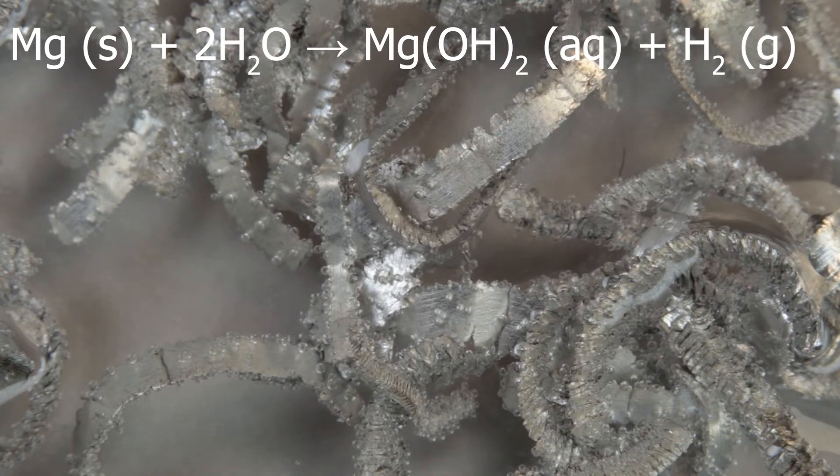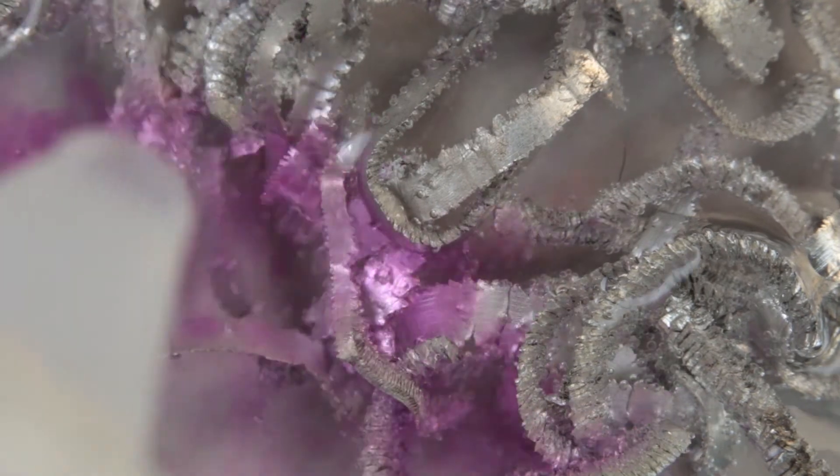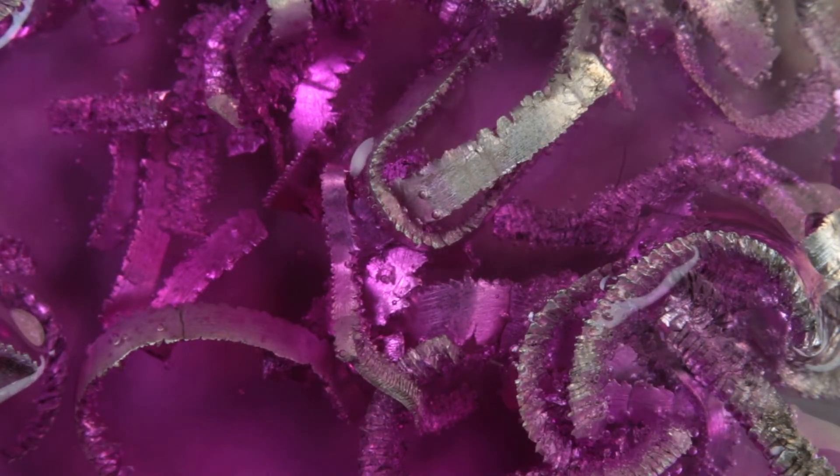Another product is magnesium hydroxide, which is slightly soluble in water, turning solution alkaline. If I take an indicator, phenolphthalein, yes, it turns violet, confirming alkalinity.